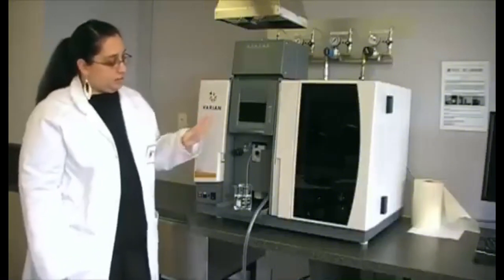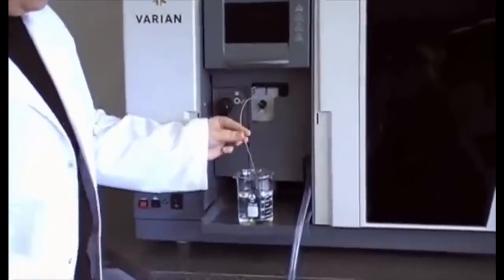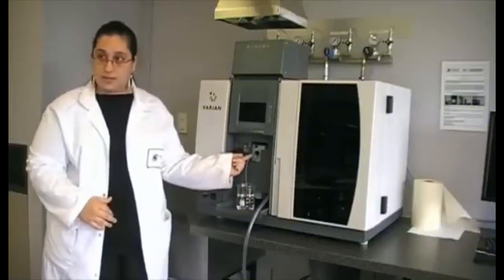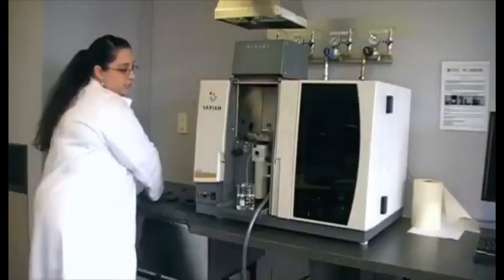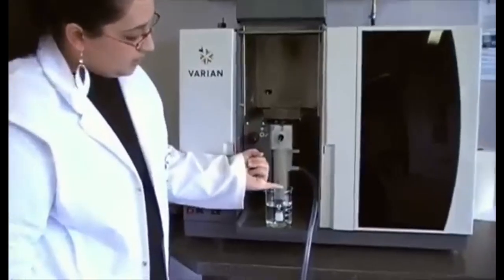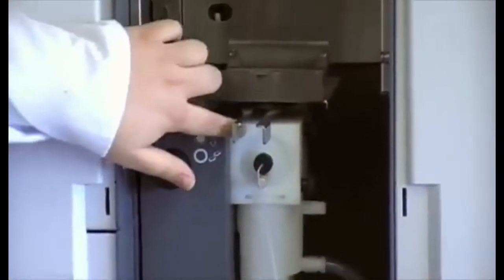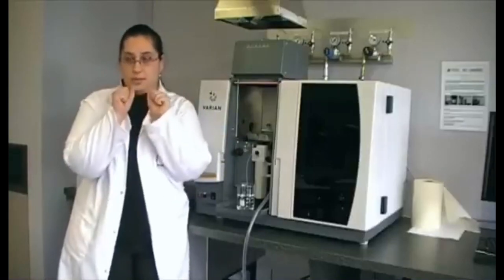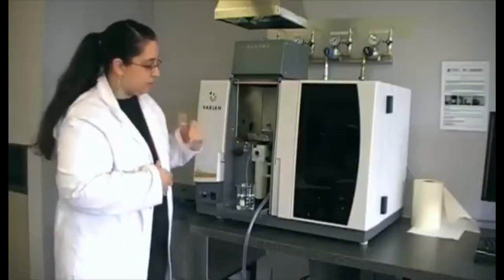So the first part of this type of analysis is to introduce the sample into the system, and that's done using this fine capillary tube. Our sample will be drawn up into this capillary tube and it's going to make its way into the nebulizer. If I just pull this heat guard off, we can have a clear look at what's going on in here. Sample is drawn into the capillary tube and this white section here is called the nebulizer. This is where the sample that's already in a mist becomes an even finer mist, a very, very fine spray of droplets of your solution containing your sample, the metals.